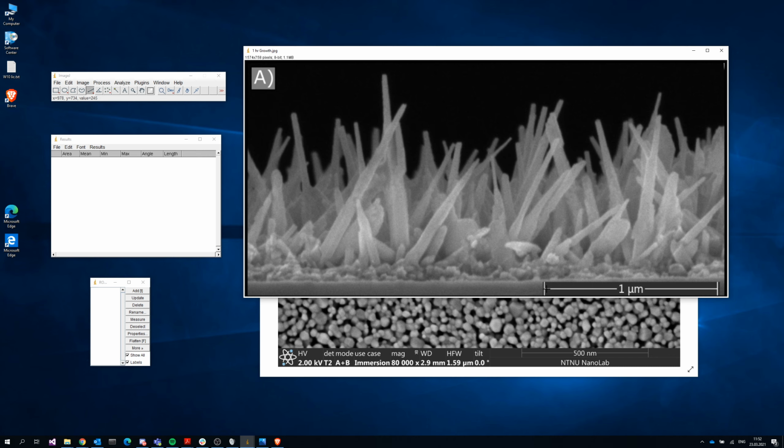We have this, Control M, and our length is 566 pixels. To make sure we're pretty consistent, you can do this multiple times on the scale bar to make sure that we're in the same ballpark. Control M. That was 566.01 pixels. So we're pretty close. We can take that, go to Analyze, set scale.